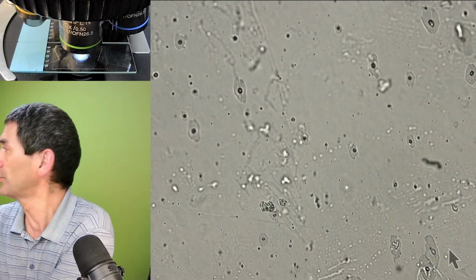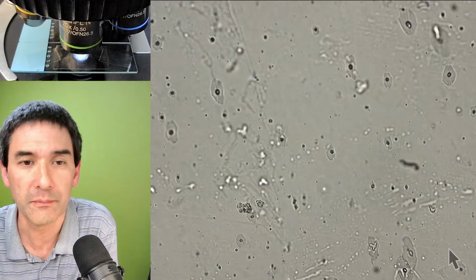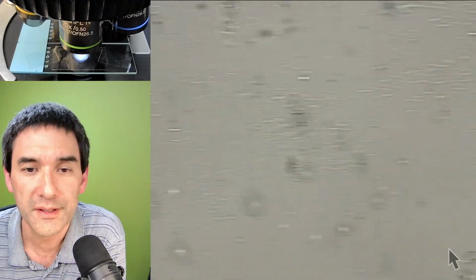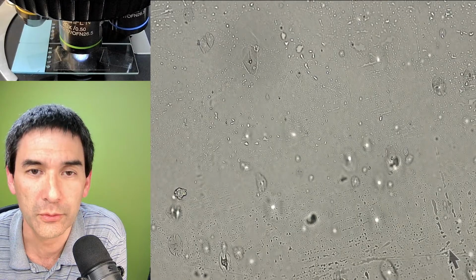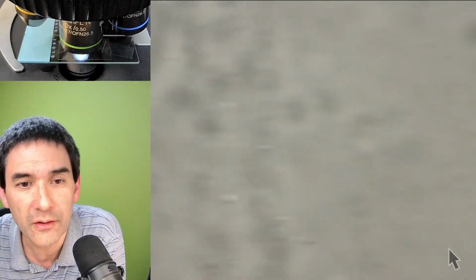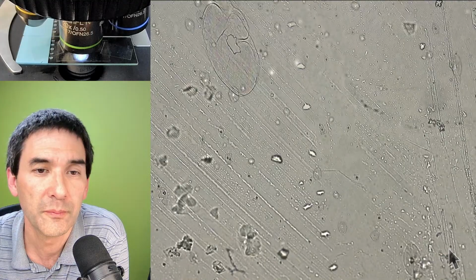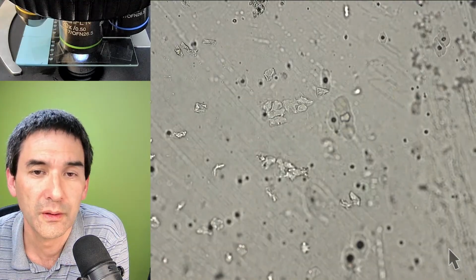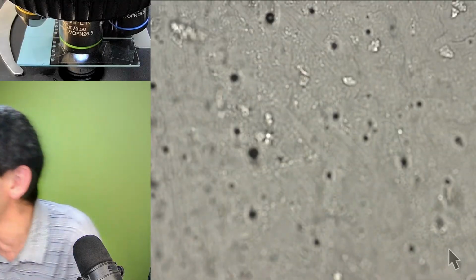Oh, thank you very much. The questions are here again, and then we basically scan the tape again, hoping to be able to find. But over here I've not got anything. Ah, here, I think. Places where you were able to find some more cells here. Let me quickly check.